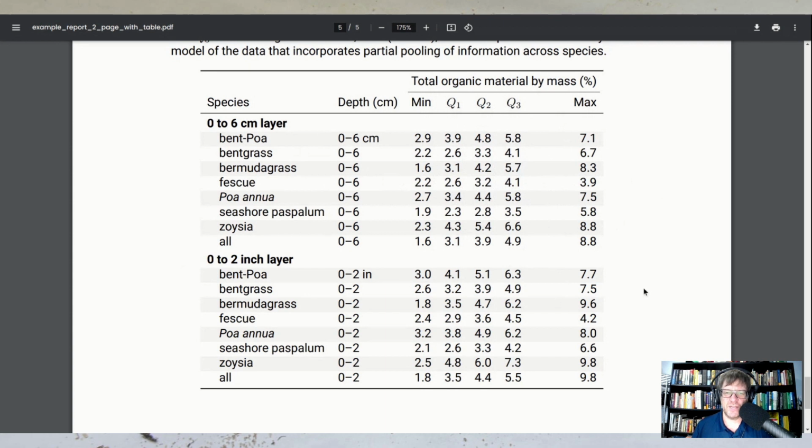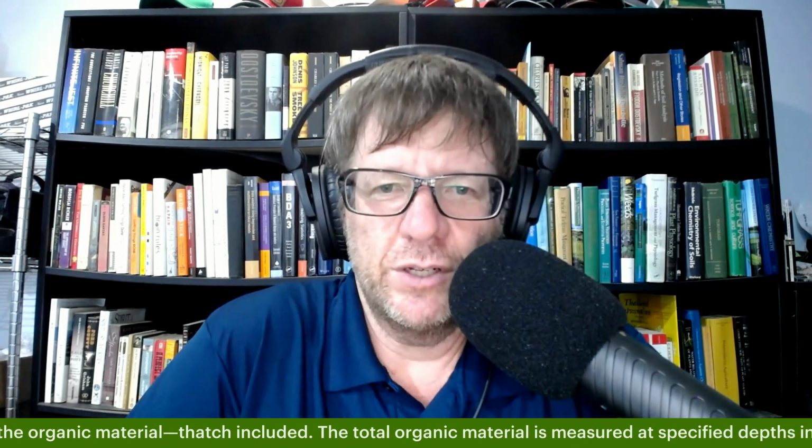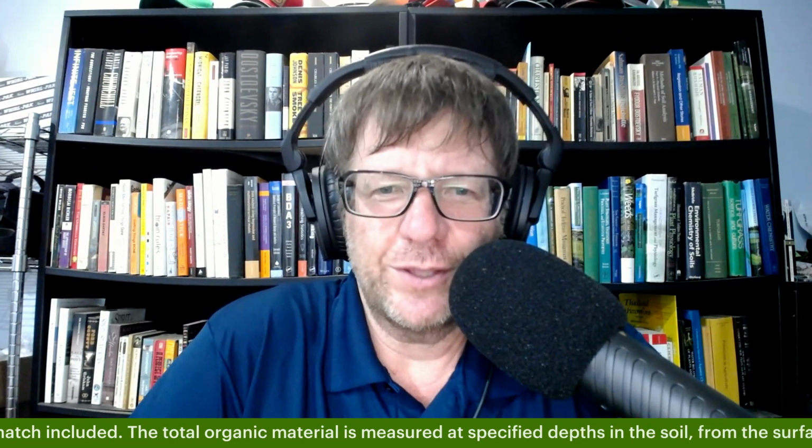So this is something that we can predict, what a Serangoon grass green would be, and we can also make some predictions about what fescue would be, even though I only have a limited amount of fescue in the database. So this is something new on the ATC OM246 soil test reports, and I wanted to share that with you as soon as possible so that anybody who gets some reports coming up in the next month or two will perhaps have a preview of what they're going to be looking at.